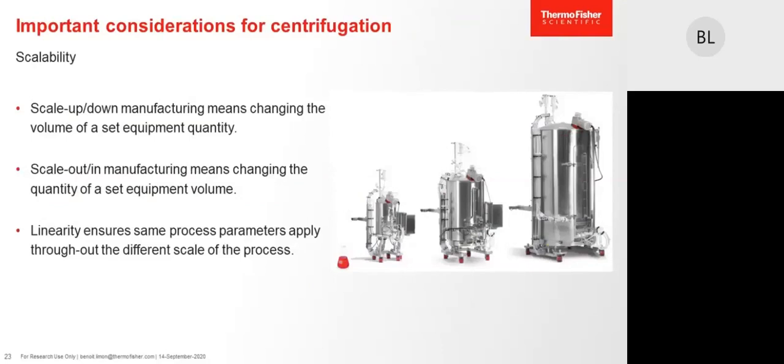So one common question is, how do we scale up with the centrifuge? And then once the scale up factory is ready and running, one would like to create a scale down model in case process optimization is required, and then change some parameters on small scale, on the scale down model, to test and validate before implementing the change on the large scale factory.